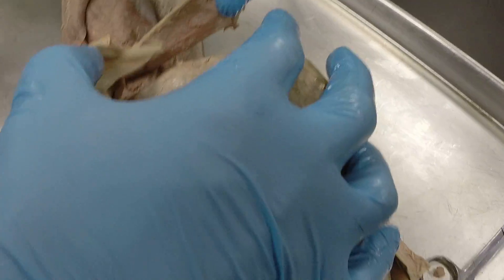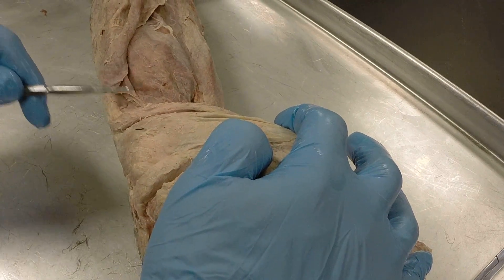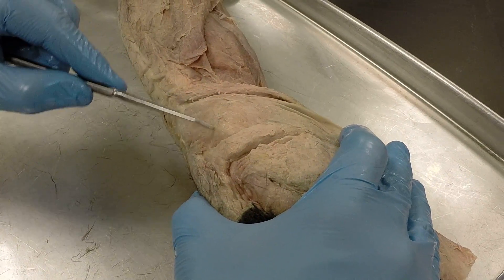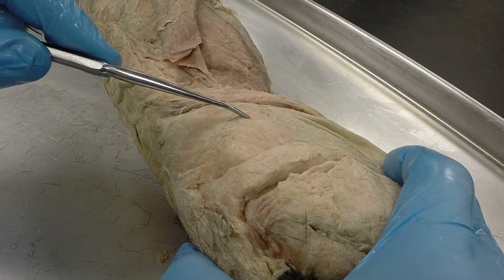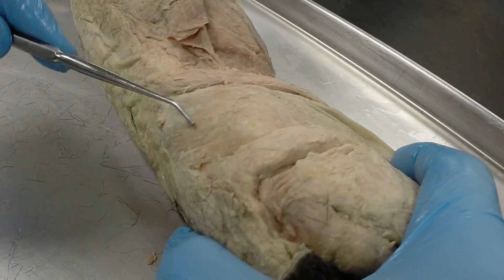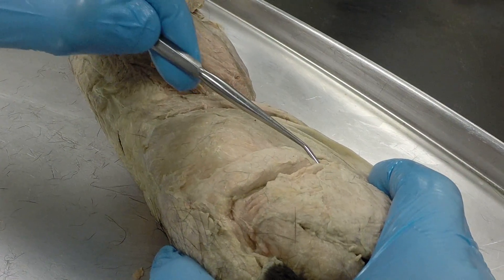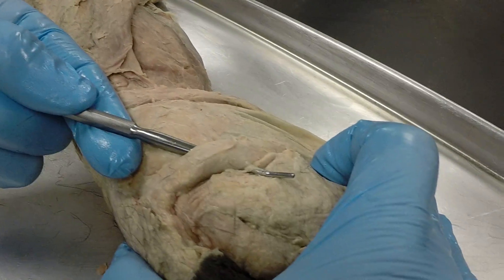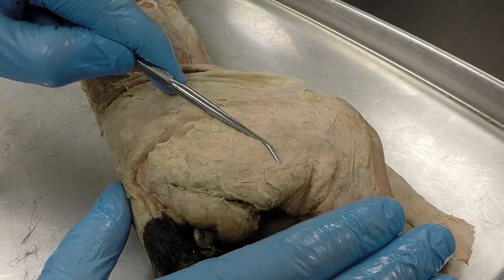Moving to the lateral side of the hind leg, you have the sartorius, the tensor fasciolata, and then closer to the spine is the gluteus medius. The next in order is the gluteus maximus, which is just a thin little muscle. Then there's a small filament of a muscle, which is the caudofemoralis. Then you have a large muscle over the whole lateral side of the leg — the biceps femoris.